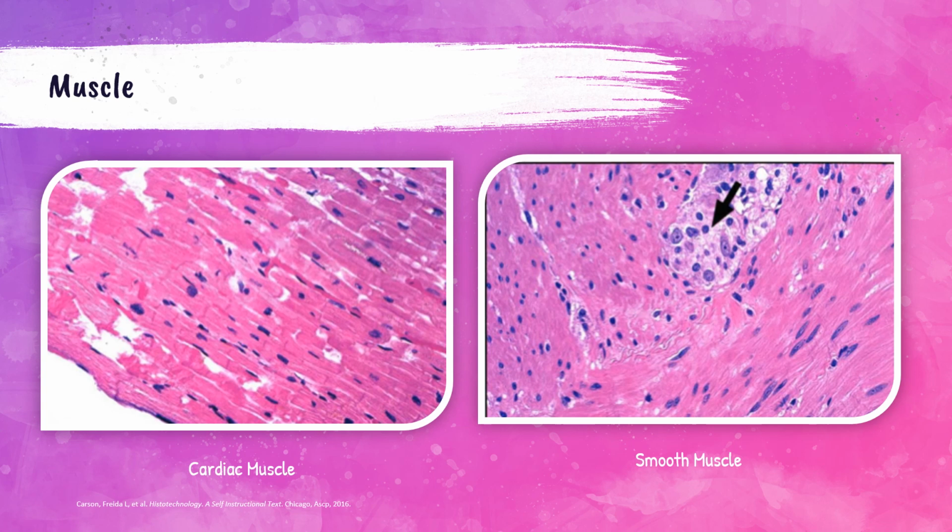So the tissue on the top left part of the photo, and here's the bottom right. I'm going to talk about these both individually. The upper top left is in cross section, and the bottom right part of the photo is the tissue longitudinal, and this is characteristic of external muscle layers of tissue in the gastrointestinal tract of humans. Now the black arrow here is pointing towards a collection of nerve cells, which is also called a ganglion.